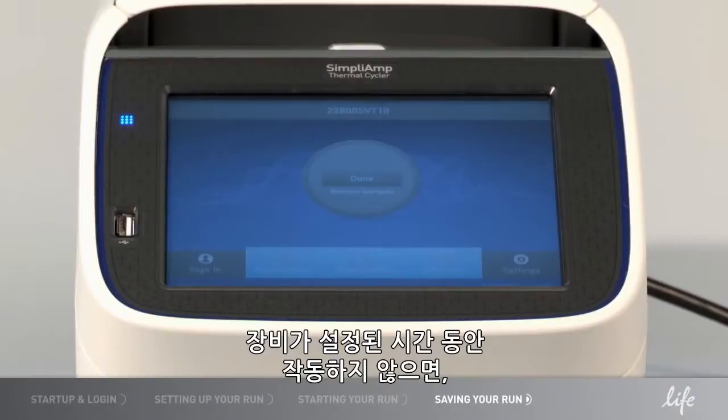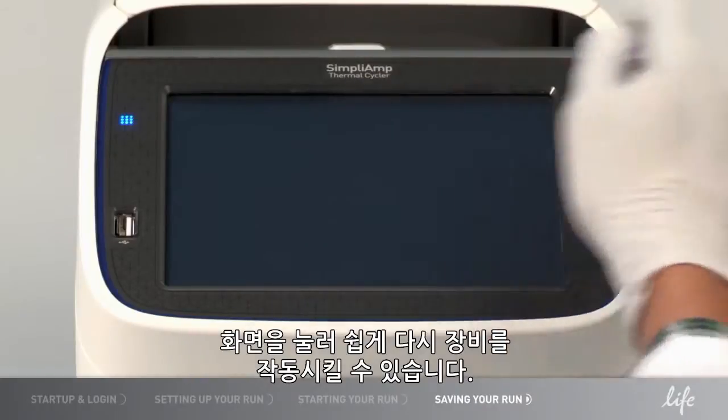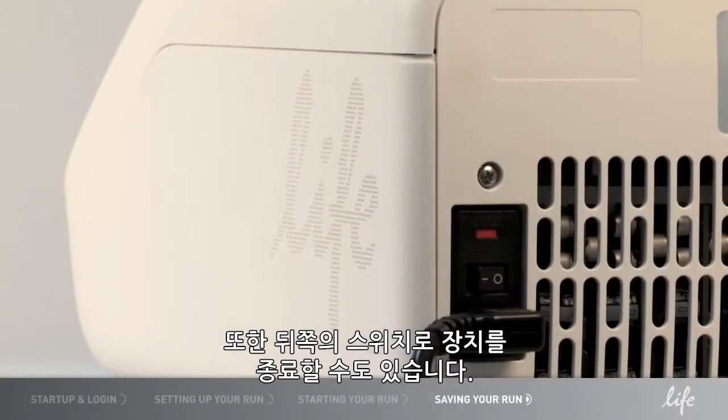If the instrument is inactive for a set period of time, it will go into sleep mode, which you can edit in settings. It can easily be activated again by pressing the screen. The instrument uses minimal power during this mode. However, you can also shut down the unit with the switch on the back.